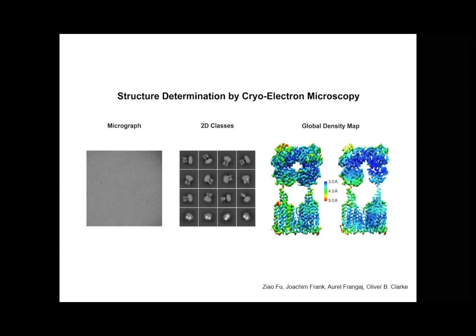To solve the receptor structure, we tried both crystallography and Cryo-EM. Unfortunately, we were not able to obtain any diffracting crystals of the receptor. We also struggled with Cryo-EM initially. We obtained help from multiple groups, including Dr. Richard Henderson and Dr. Xiaoxia Chen at MRC, and Dr. Bill Rice and Dr. Ed Eng at NYSBC.